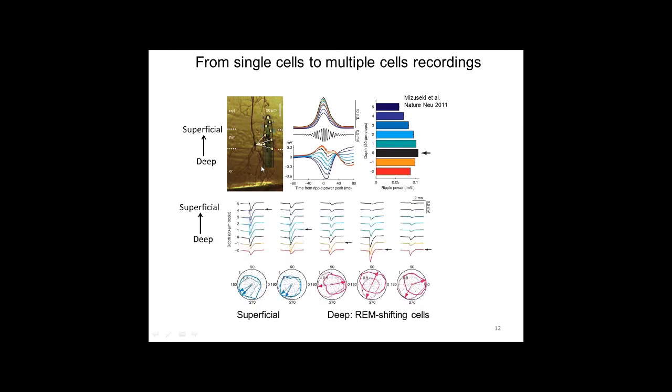And that proved to work pretty well, hopefully because the hippocampus is so well organized and the laminar organization is so straightforward that you can see cells having their extracellular action potential amplitude maximal in electrodes closer to stratum radiatum, or more into these superficial regions, as compared with other cells that have their maximal action potential amplitudes in electrodes located deeper.